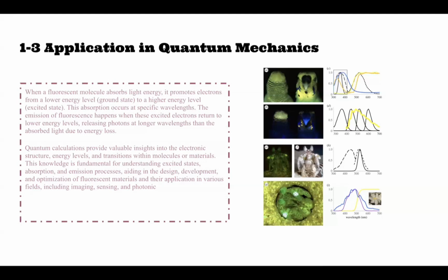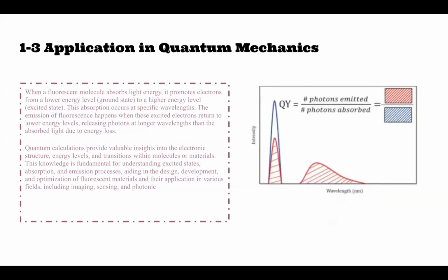Additionally, this image discusses the spectral sensitivities of the crustacean photoreceptors and their match to fluorescent emission. This primarily focuses on visual observations and spectral analysis of fluorescence in these creatures under different light conditions and in their natural environments.